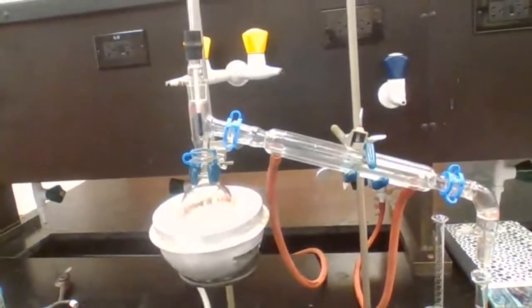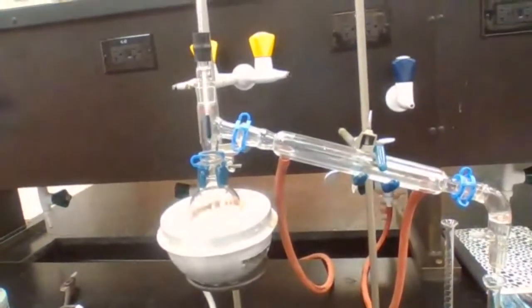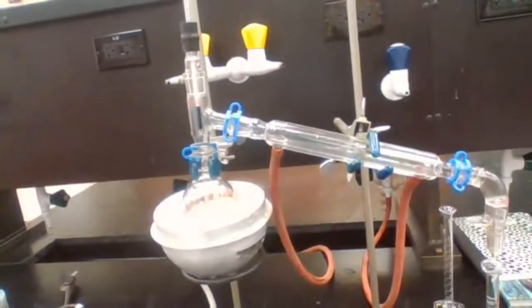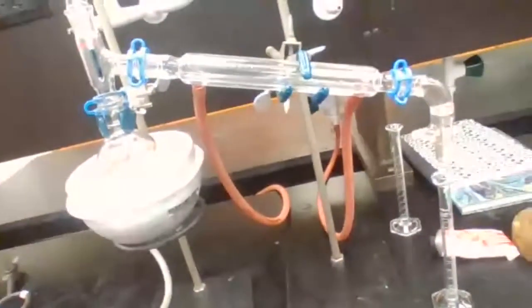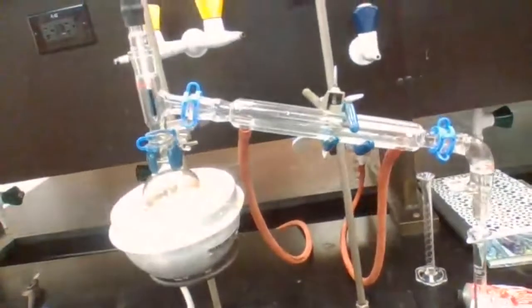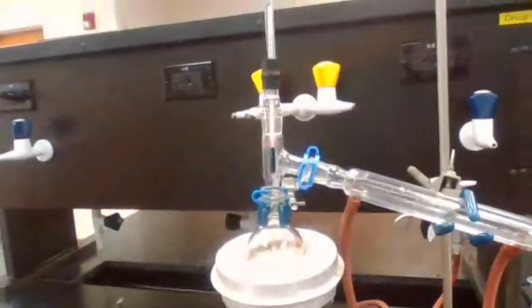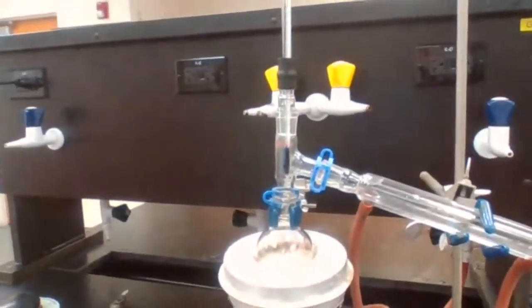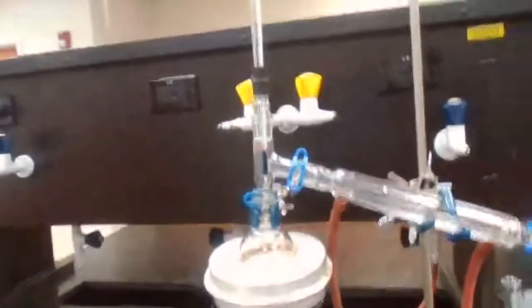So it is boiling now, but we are not recovering any liquid yet. We're just waiting for the first drop. The first drop came in. You see the first drop is dropping now. With that first drop, you need to record the temperature, and the temperature is 50 degrees Celsius.